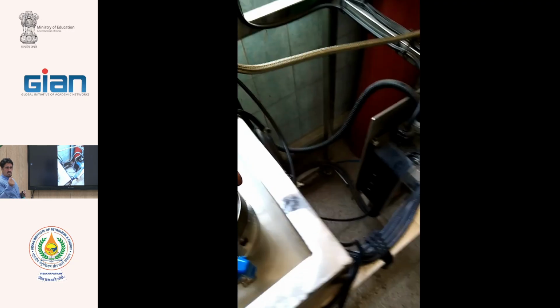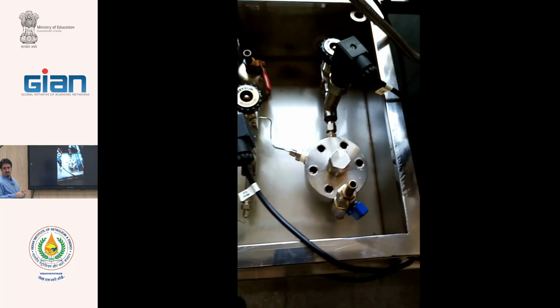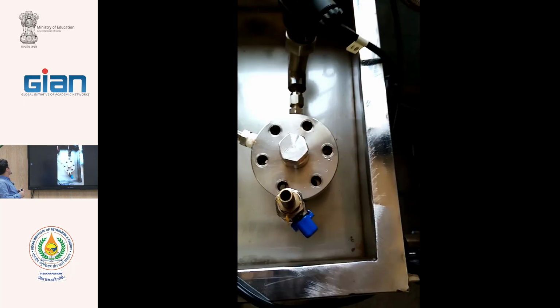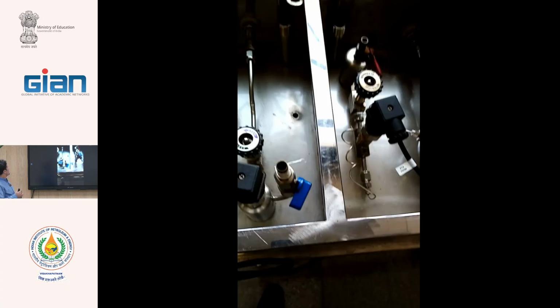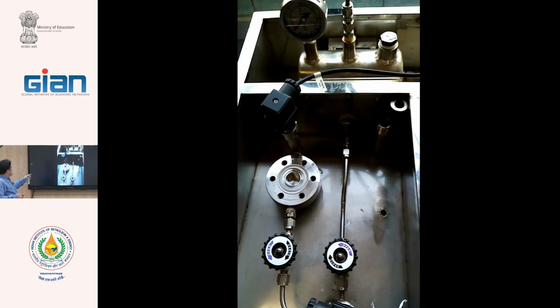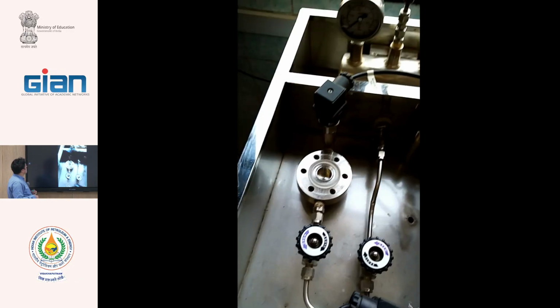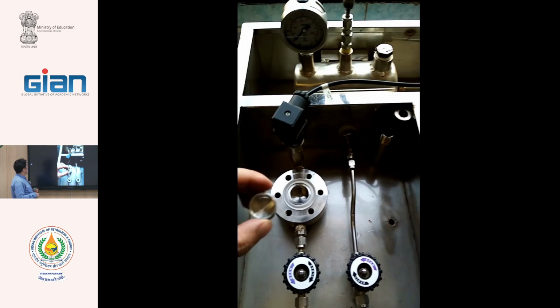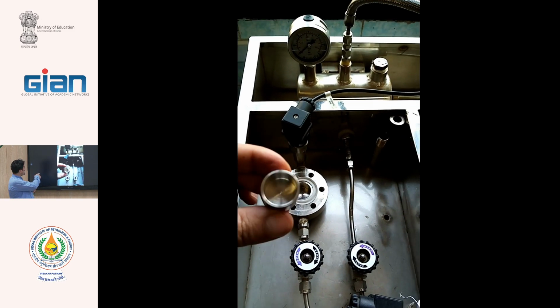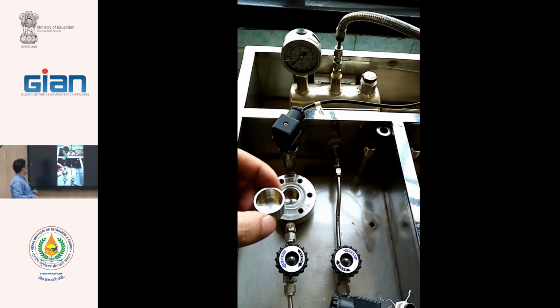We want to use a lower amount to reduce the expense of the experiment. This is the adsorption part. We have a very small dish. We put the 1 gram of polymer here and put them in this one.